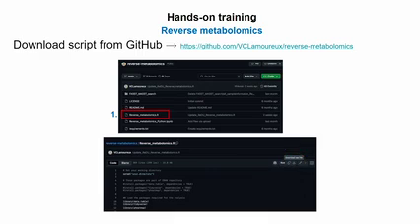On the main page, it's not highlighted here, but you should see the REDU metadata or all information with a specific date on it, and this will be the REDU metadata. So just download it. It's going to be a zip file. Unzip it, and drag and drop it into your first folder on the desktop. Otherwise, I think we'll have a problem downloading this file.